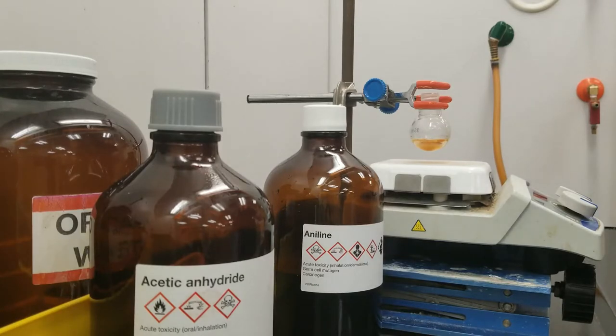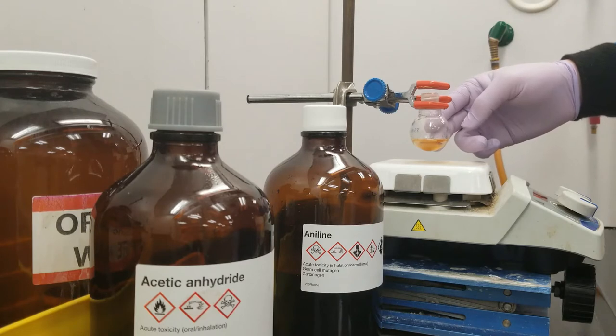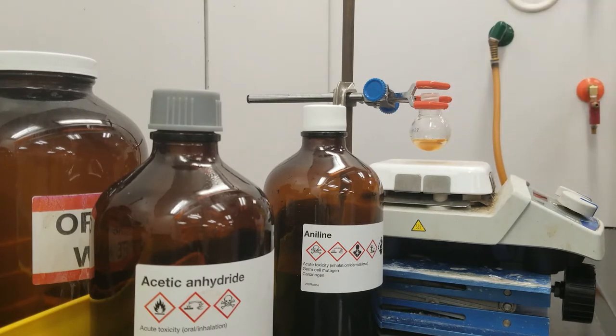Hello everyone, we're back today. I'll walk you guys through the procedure for the acetylation of aniline.